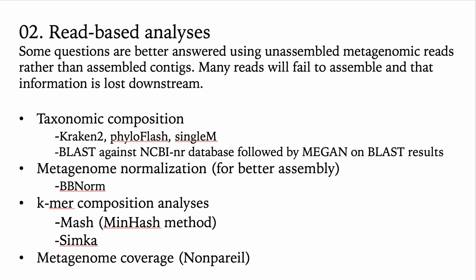So once you have your high quality short reads, you can do a number of read-based analyses. So this is without assembling them into longer contigs. You can take just those raw reads and do a variety of things. This is helpful because a lot of reads will fail to assemble. They'll be left out of your assembly essentially, and so you've lost that information.